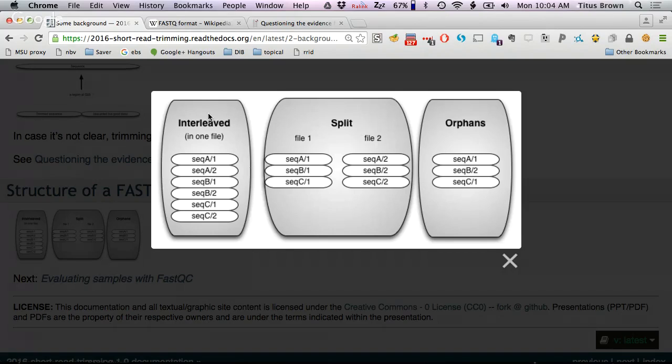And this information can be delivered to you in two ways. This is where the interesting biology or methods question, which is, hey, I have a paired end read and I got two sequences from the same fragment and I want to keep these sequences together, hits the brutal reality of computing, which is that now we have to figure out how to encode that information in some way. And the way that information is encoded is in one of two ways.